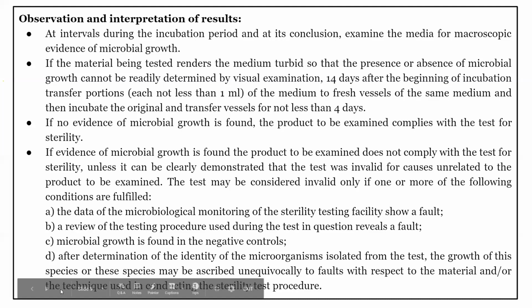Okay, next is observation and interpretation of results. So at intervals during the incubation period and at its end, they examine the media for macroscopic evidence of microbial growth. So during this 14 days time period of incubation, and at the end of the 14th day, the media is observed or visualized for the colonies which are formed by the microorganisms.